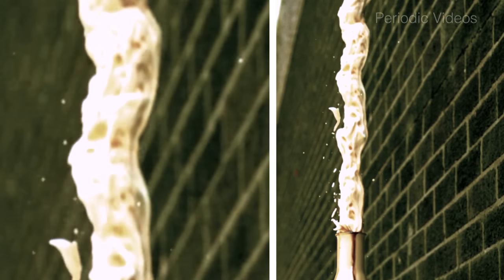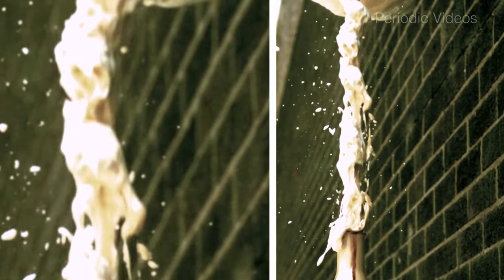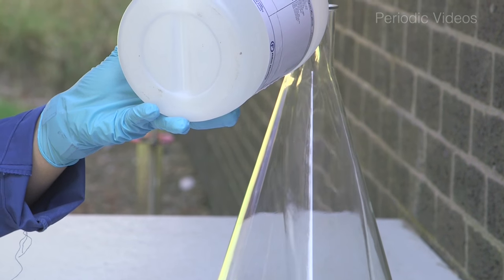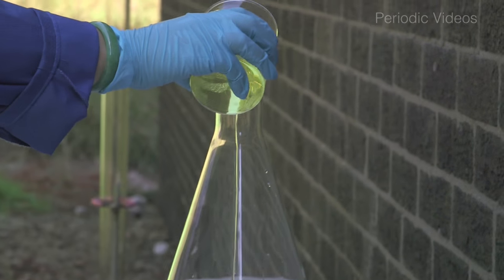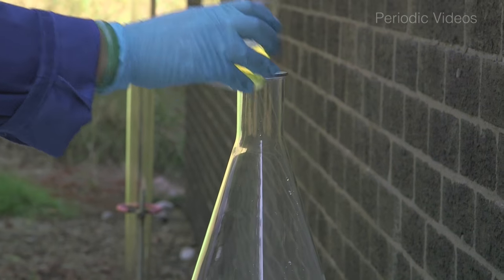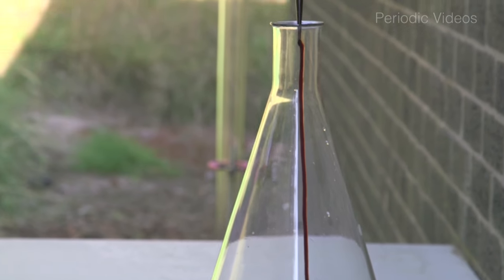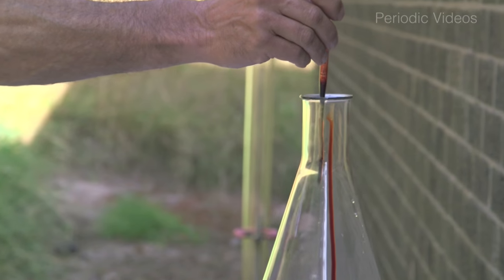Now like most reactions you need some energy to get it started, because hydrogen peroxide does not spontaneously fall apart at room temperature. So in this reaction in the demonstration you have hydrogen peroxide, a bit of soap to cause foam — just washing up liquid, liquid detergent, whatever you want to call it. Sometimes people put in a bit of colouring so it looks a bit more dramatic, and then you have to drop in a catalyst which reduces the amount of energy needed to break the first few bonds.